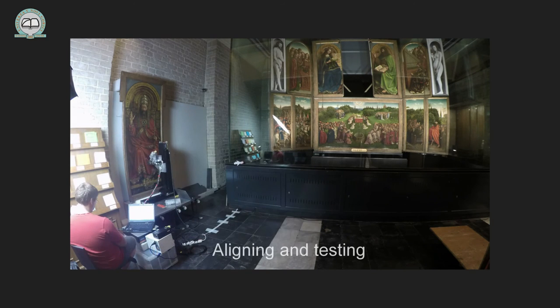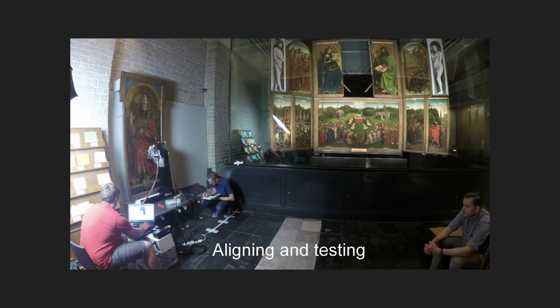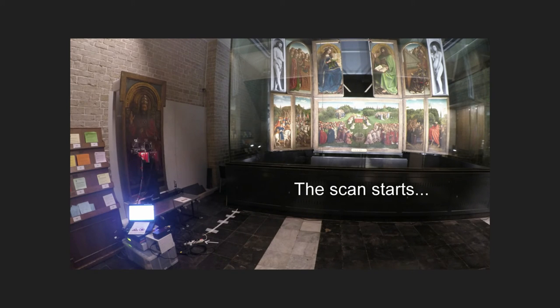So it does this and it slowly goes up too. Usually this scanning looks like it's moving relatively fast, but of course it's a speeded up video. We normally let this machine run overnight. And then the hours go by unattended and we just occasionally have a look at what's happening. Slowly the evening falls, the light goes out, and then after about 12 hours or so, our scan is finished.